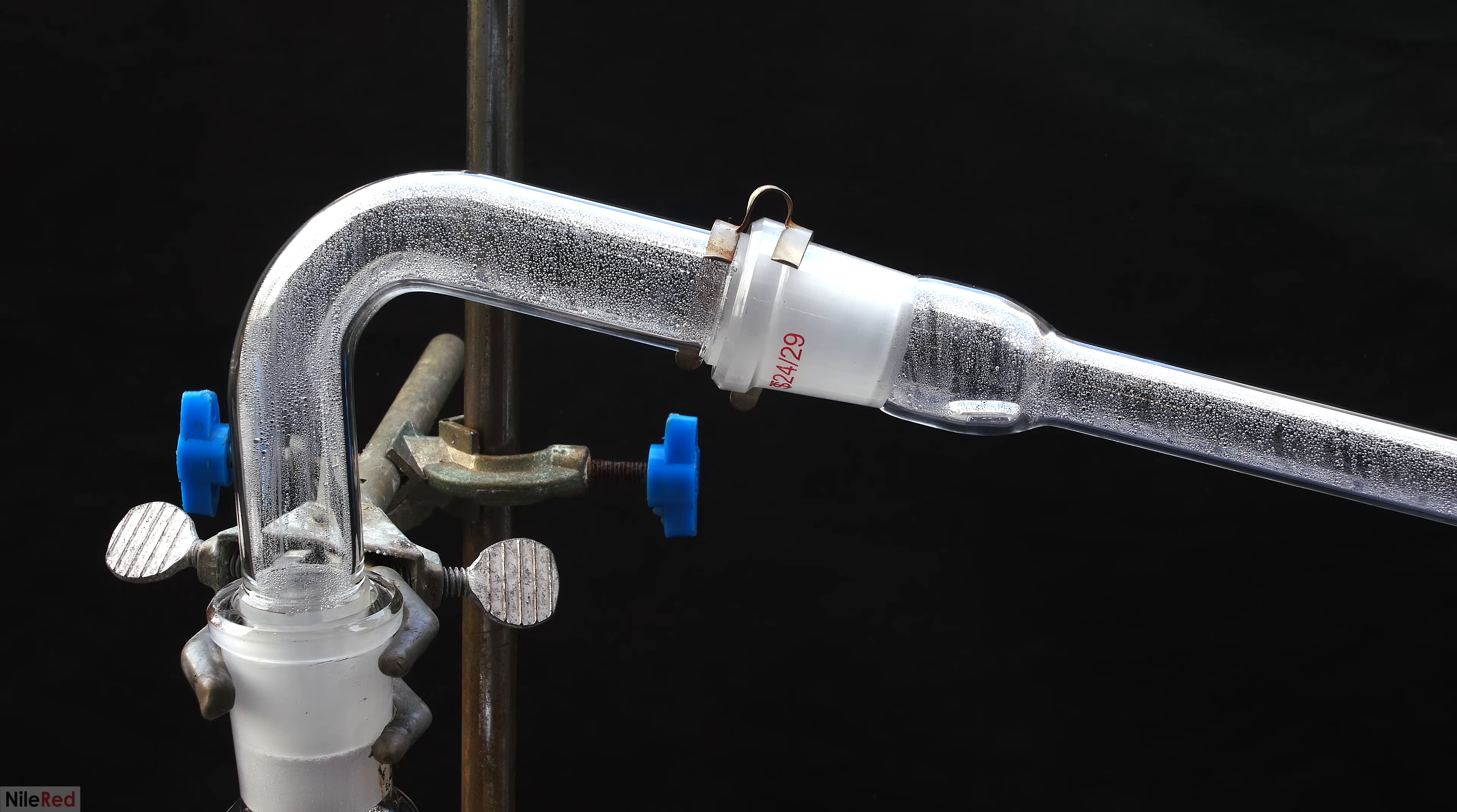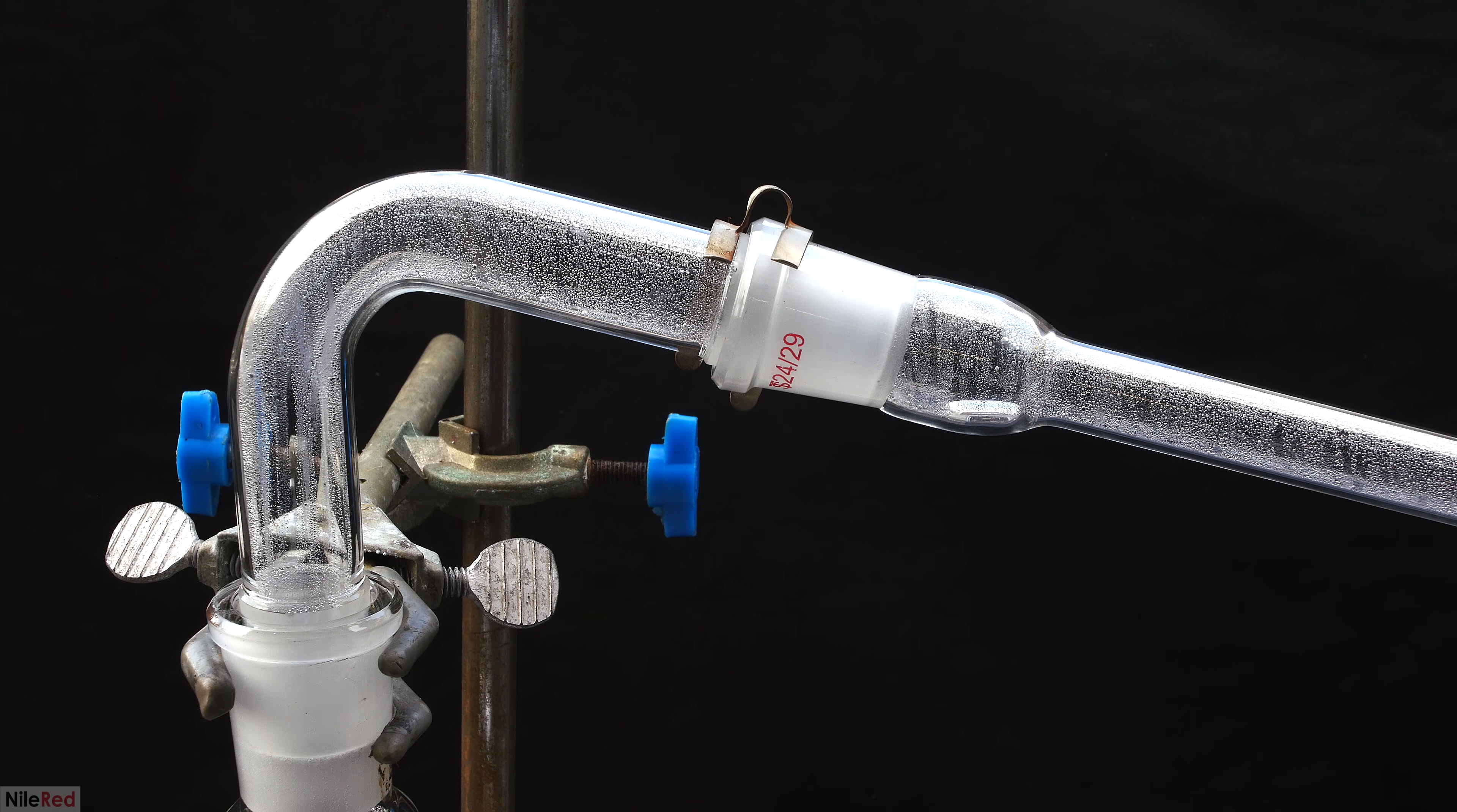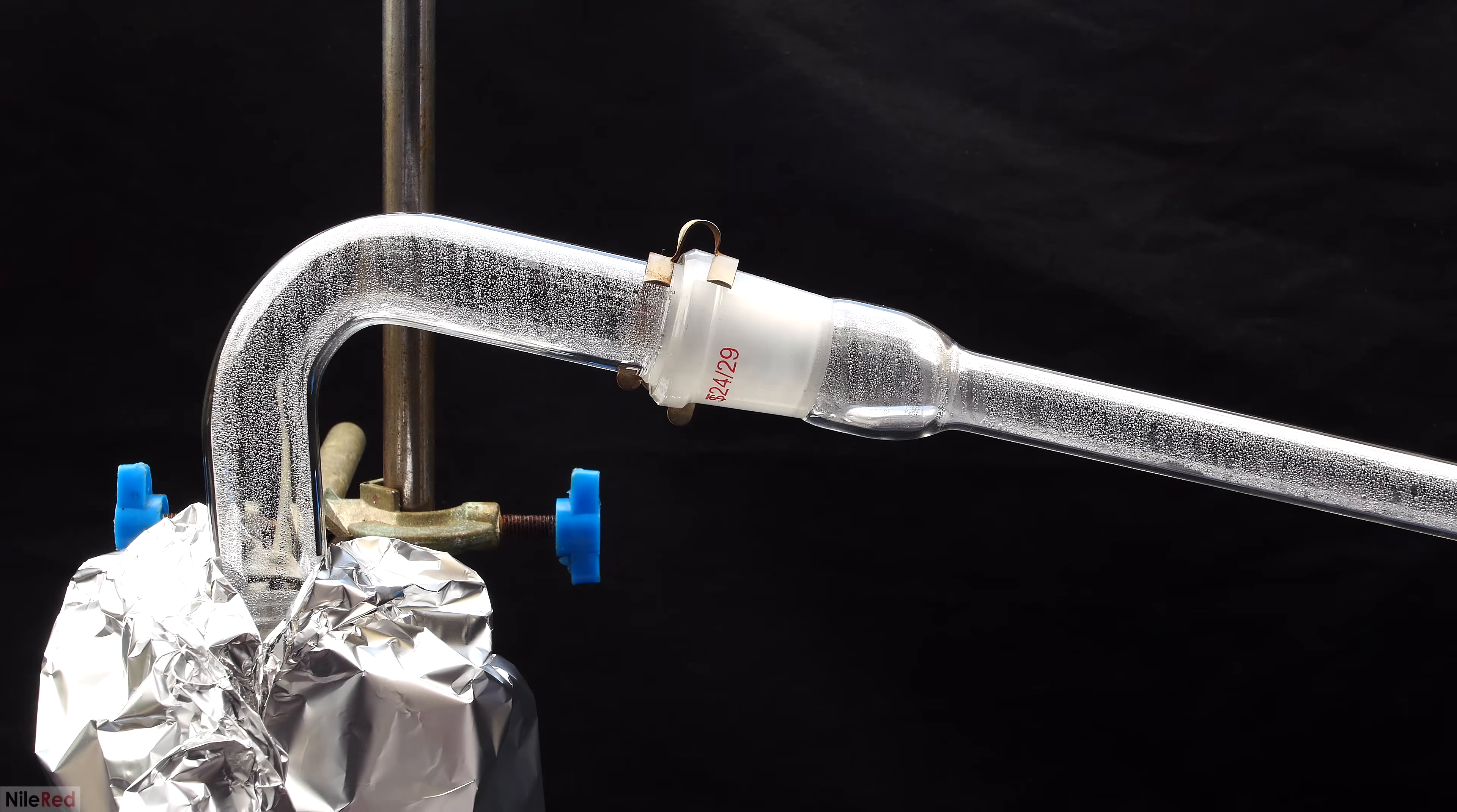With everything set up again, we can actually start the real distillation, and this time guys, I promise things work out. As the mercury vapor travels up the adapter, you can see it condensing on the walls of it. What's interesting here is that the mercury vapor is completely invisible, and we don't have something like a grey or silver cloud that you might expect with metal vapor. Also, the surface tension of mercury is really high, so it beads up immediately after condensing on the glass. Anyway, it doesn't take long for us to get a steady distillation of mercury going.